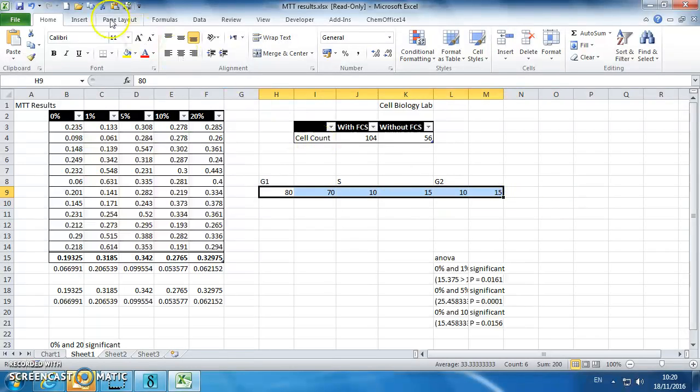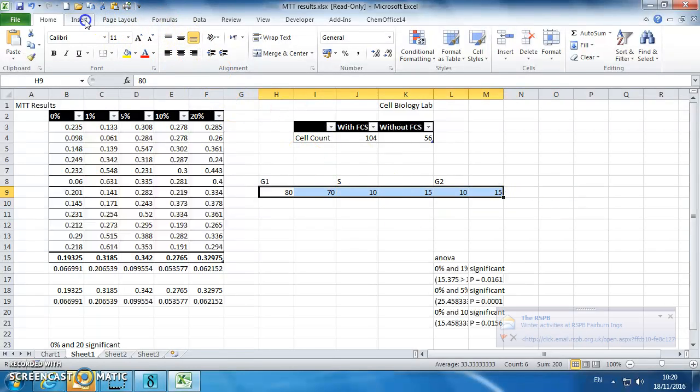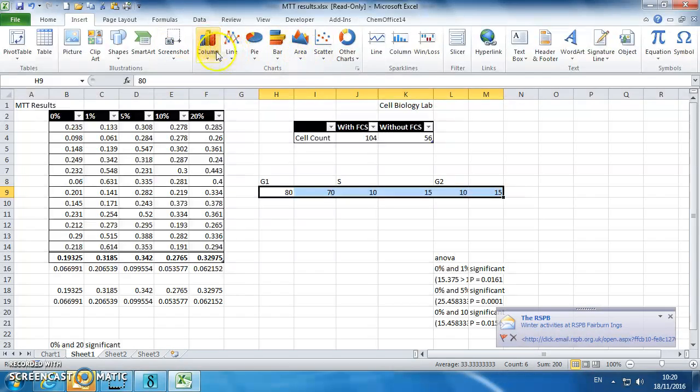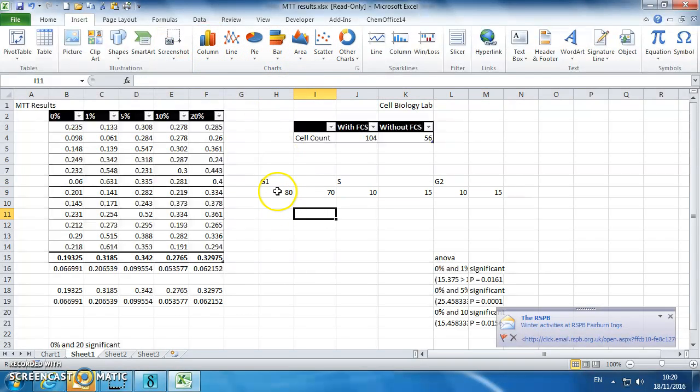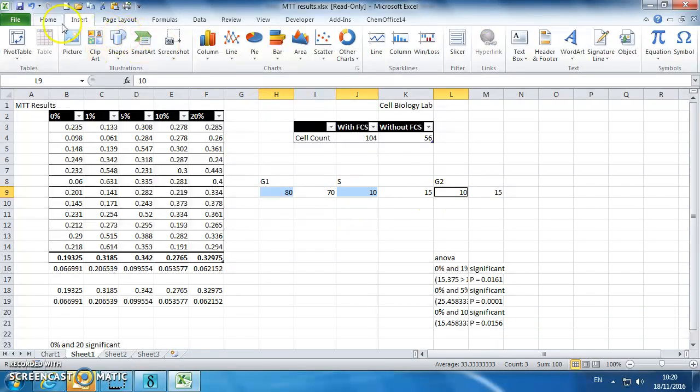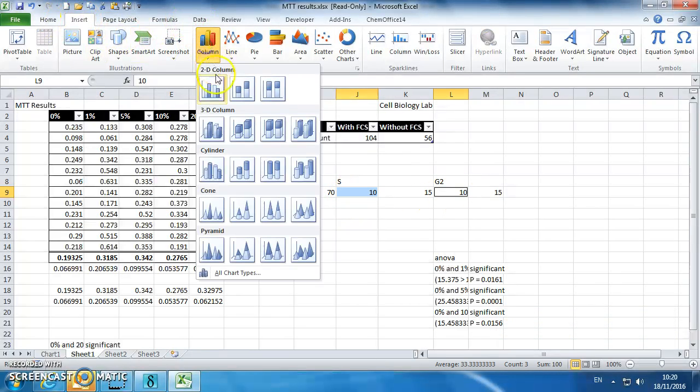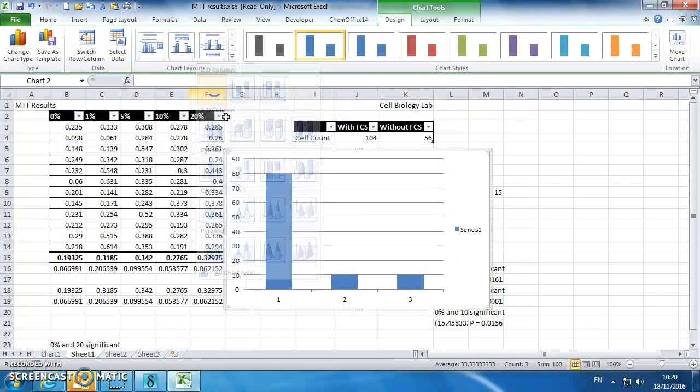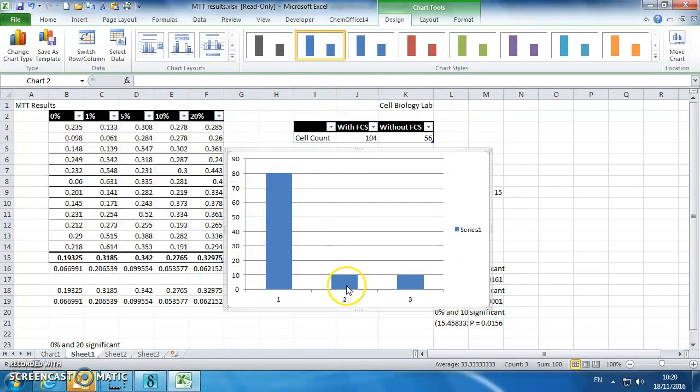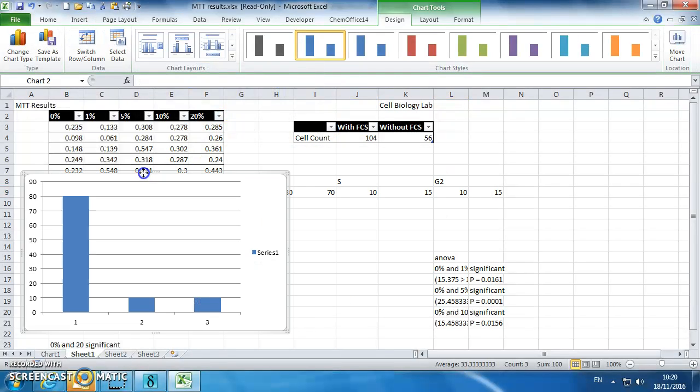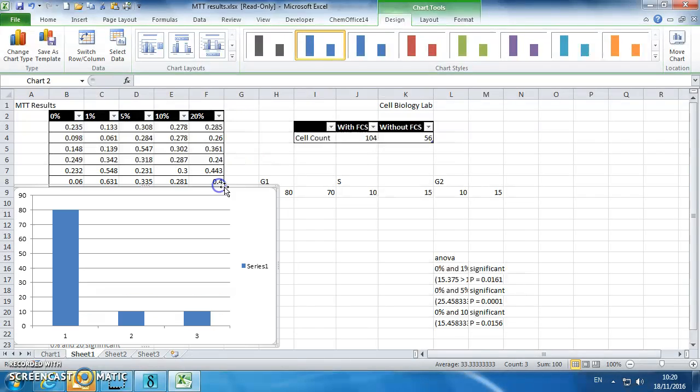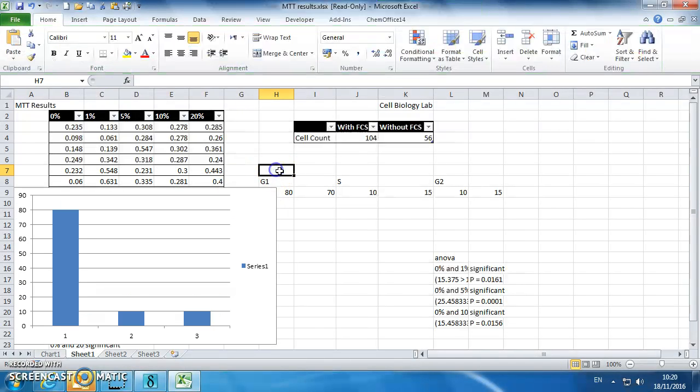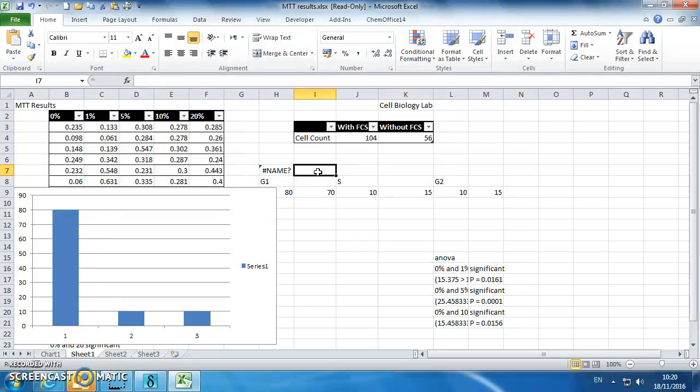We can make a graph of that, insert, and on this one we want to add two different series. I'm just inserting the first series, which is the plus fetal calf serum, and the second series is going to be minus fetal calf serum.